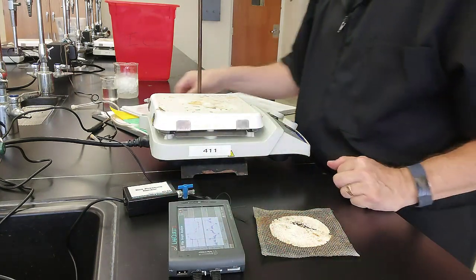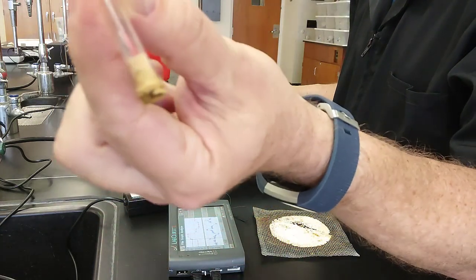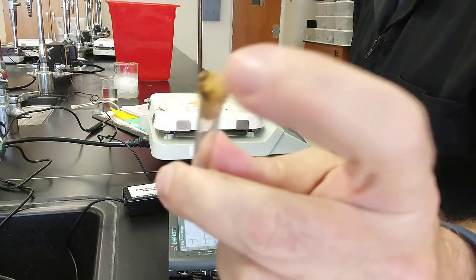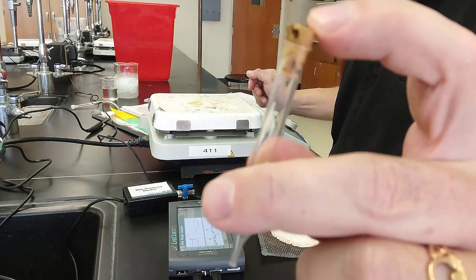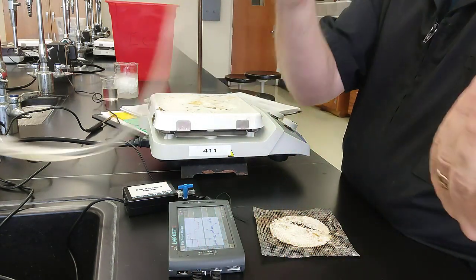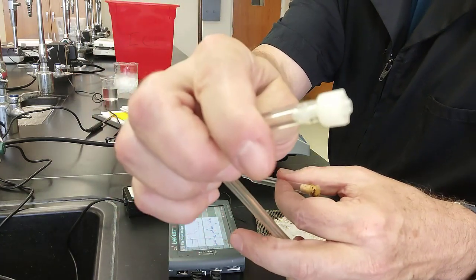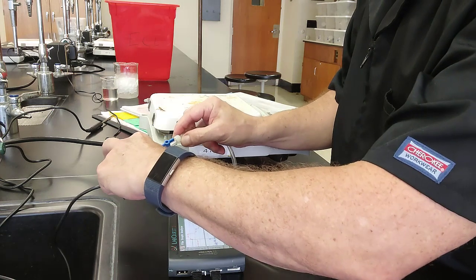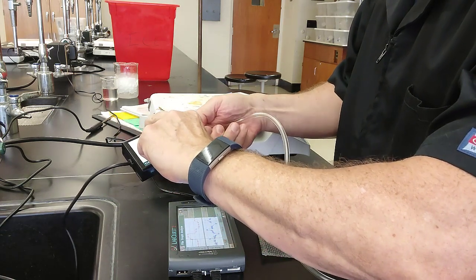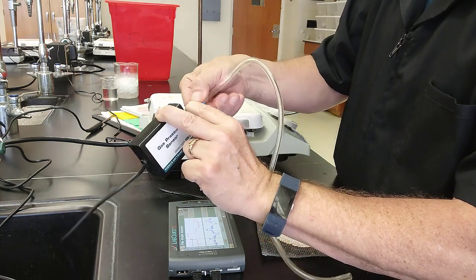And we're going to get a small dropper made out of glass or Pyrex, and we've sealed it at one end with a stopper. The other end is open, and we're going to connect it to a piece of hose that has a fitting on the end that will screw on to our gas sensor. Making sure not to rip the fitting off of the gas sensor.